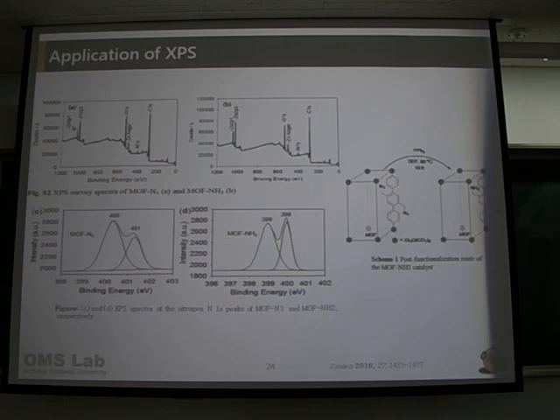했는데 두 개가 만약에 100%, this is a 100% conversion, but what if this is not 100% conversion? Then how do we know how much it'll be because they are very close? 쪼개는 걸 그냥 다 모든 픽에다 적용해주세요.